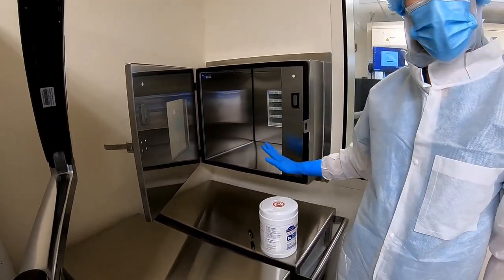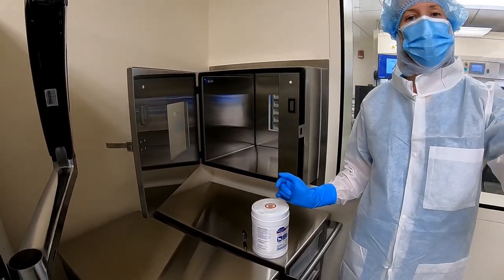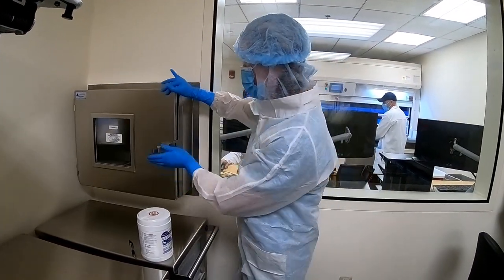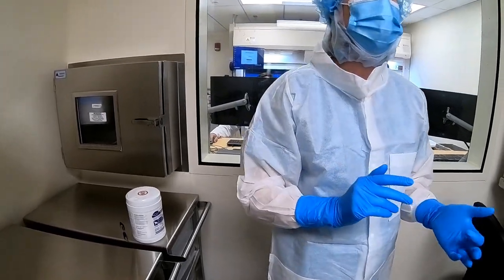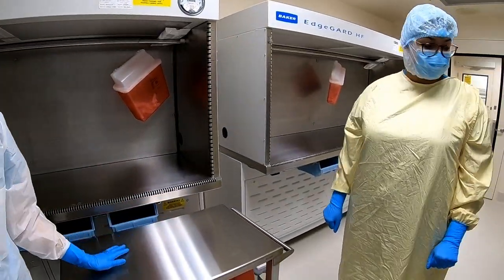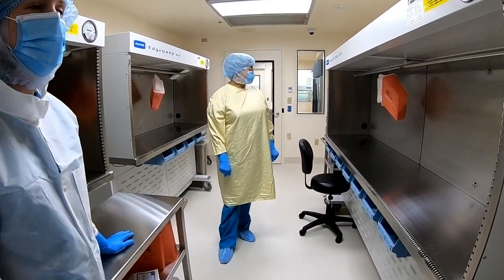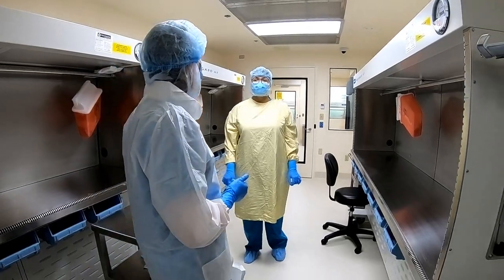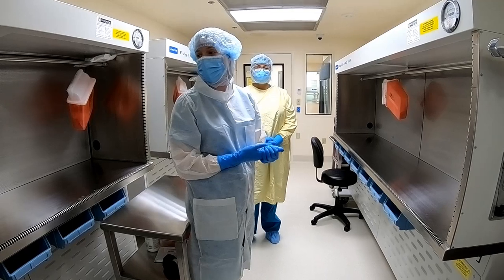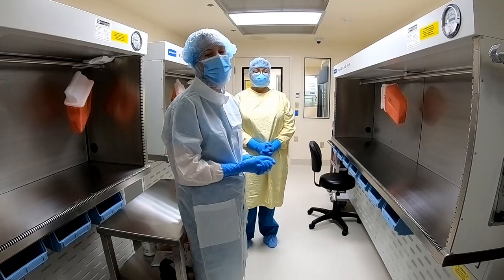The pass-through is over here, same as in the chemo room. Ideally your stats will go through the pass-through to reach the pharmacist quickly, but the rest of your batch will go to the ante-room to get checked — otherwise this is going to get congested really quickly. One of the six-foot hoods will be for TG and the eight-foot hood will also be for TG, and one hood will be for Mary Bridge. Given how little space there is in here, there will be times where Mary Bridge might need to make a compound or has extra work to do, so we'll work together to share the hoods and help coordinate that.